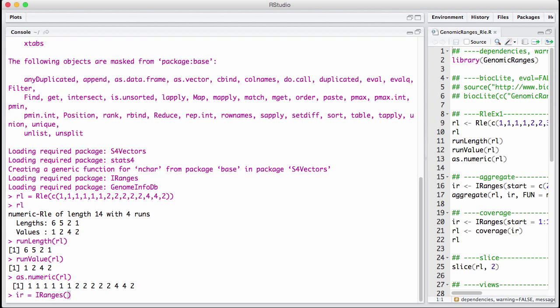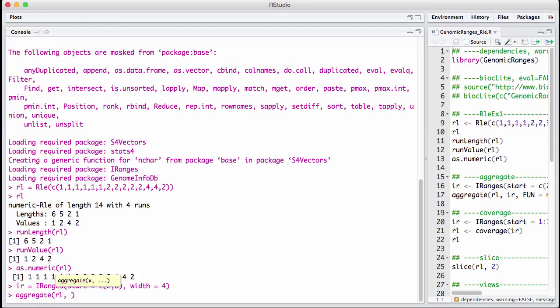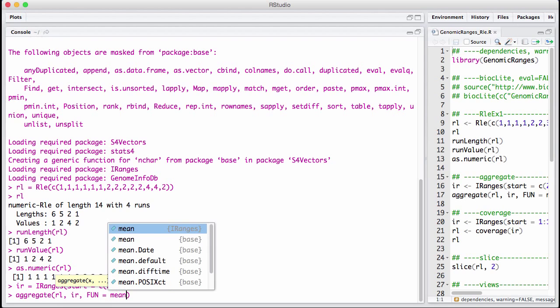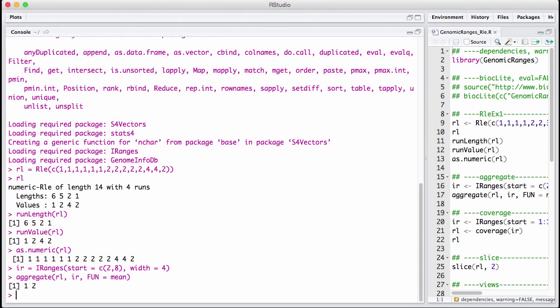We take an iranges. Let's say the start is going to be 2 and 8. And let's say the width is equal to 4. So this gives me a certain subset of the RLE. And I can now aggregate. I take my runLength encoded vector. I take my iranges. And as my function, I could take the mean. I get two numbers back.